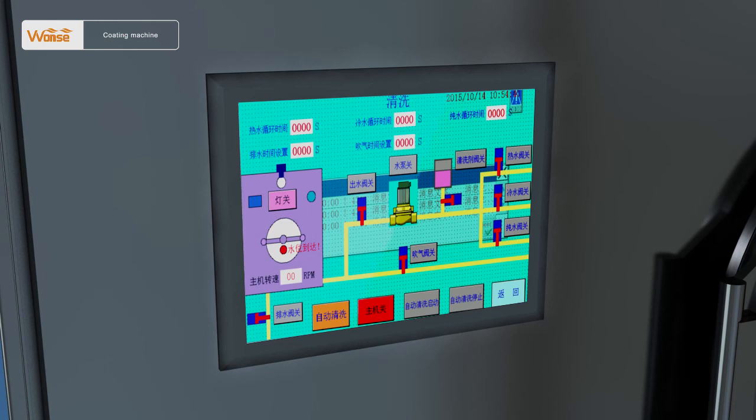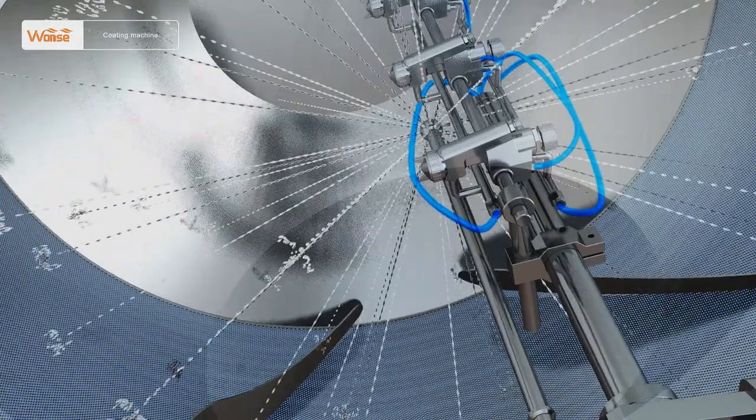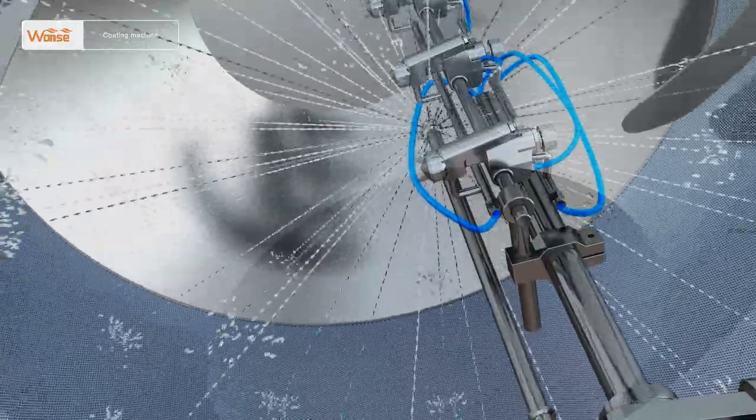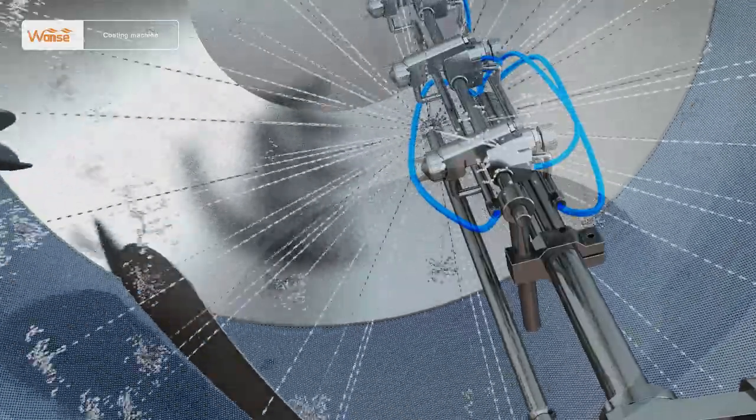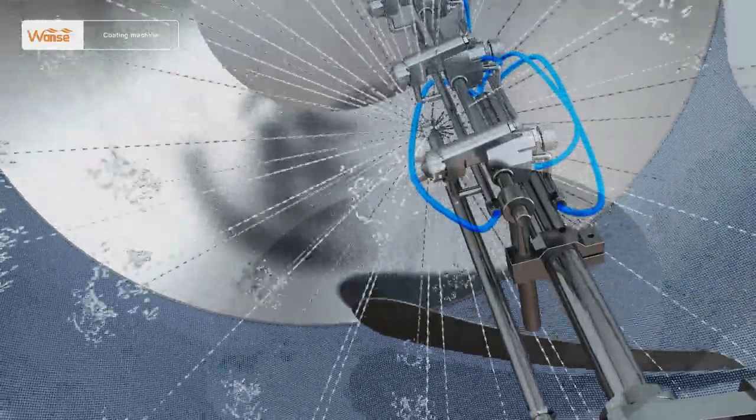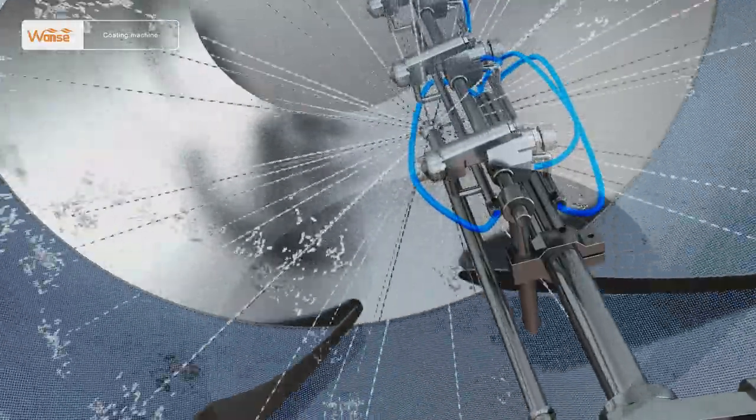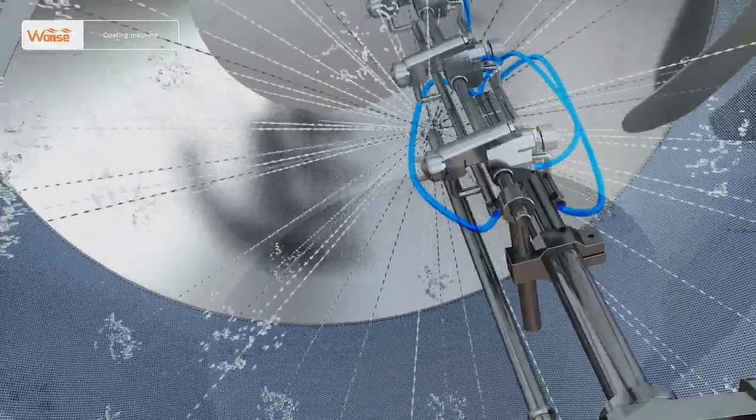Fifth, open the pure water supply valve, run the boosting pump, and open the corresponding water output valve to start the final pure water flushing. After the operation is finished according to the set time, stop the boosting pump and corresponding valves.